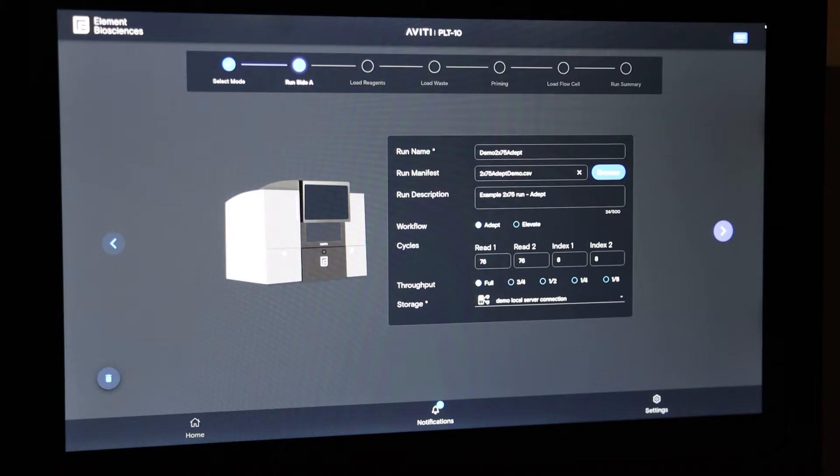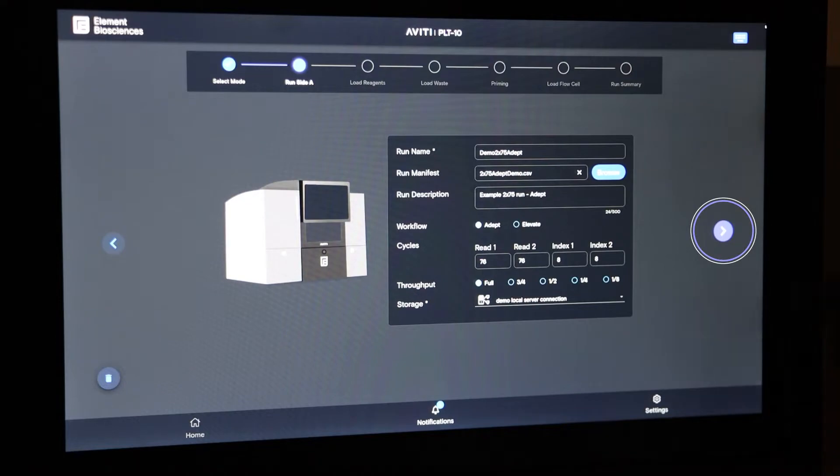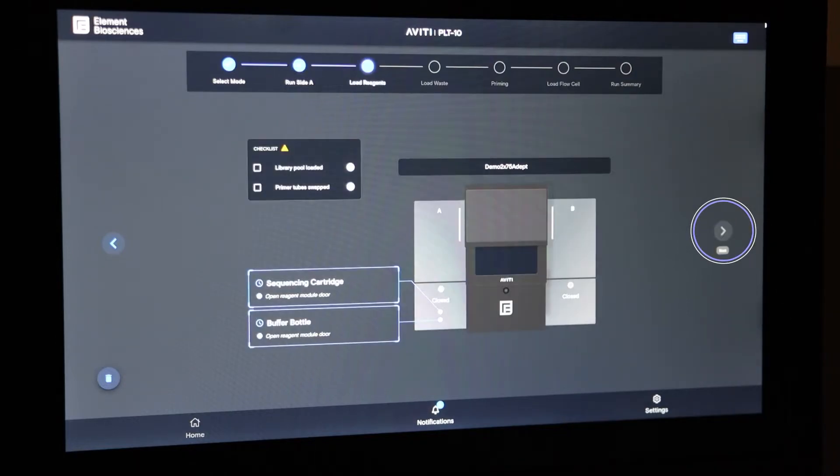At this point, the Aviti operating software is telling you you're ready to go to the next step, because the right arrow has lit up to purple. So press it to advance to the next screen.